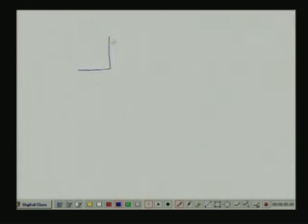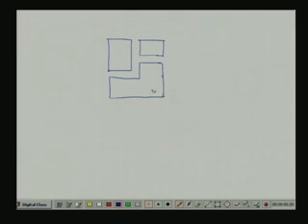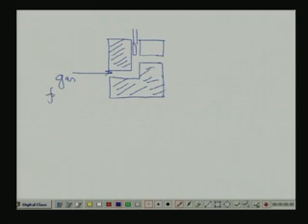I have a block that looks like this. Okay, let me take a new page. Block is there and here actually I will put the detector. So, here it will look like this, then it will go like this. Okay. So, this is our block. So, this is the gas flow in, and this is the gas flow out. Okay. And this is the block.